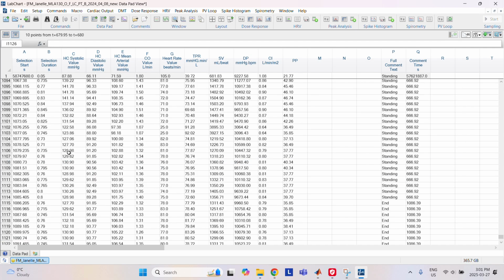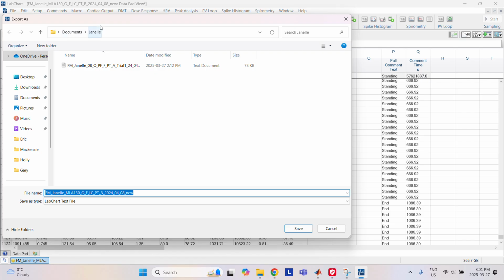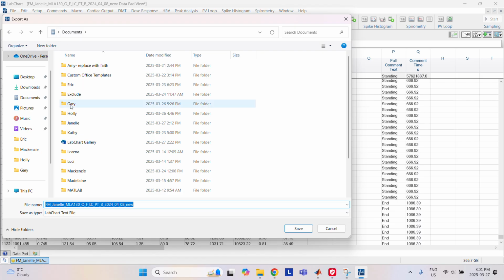Now the next thing you do is go to File, go to Export, and create a folder document for that person. This is Janelle.